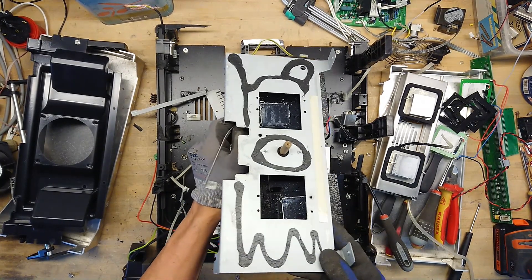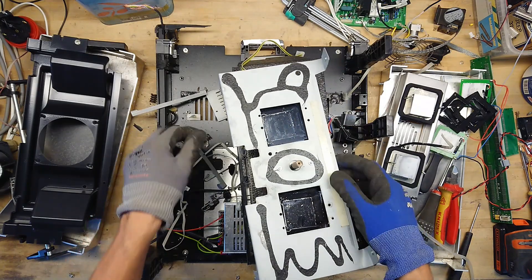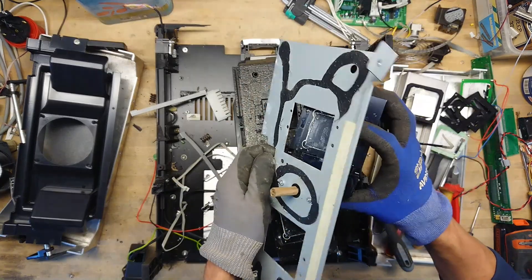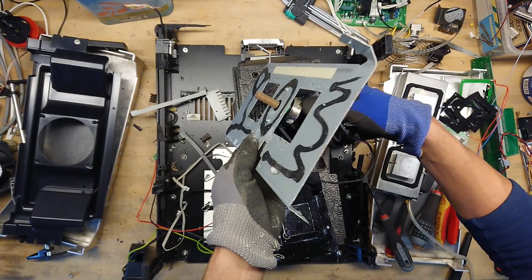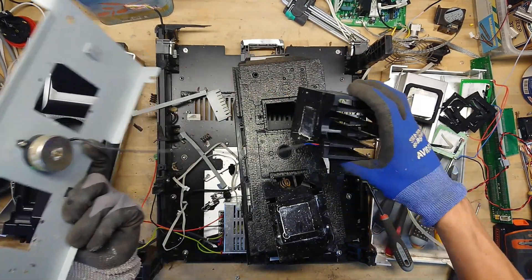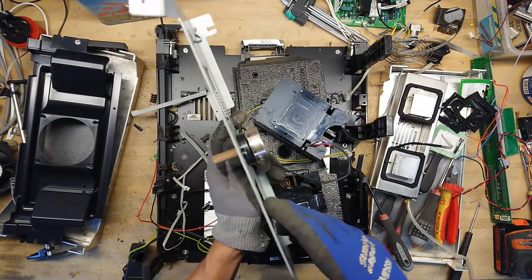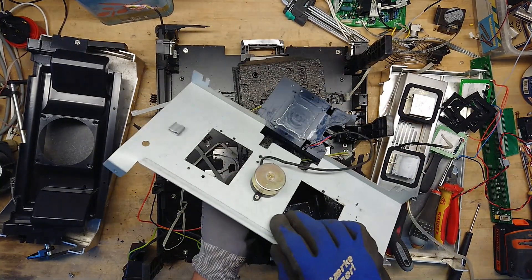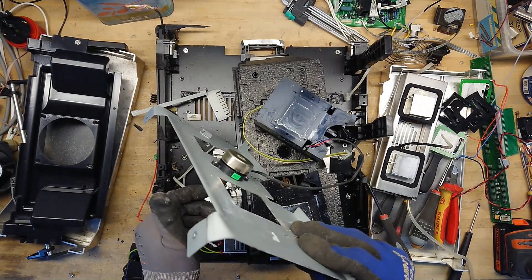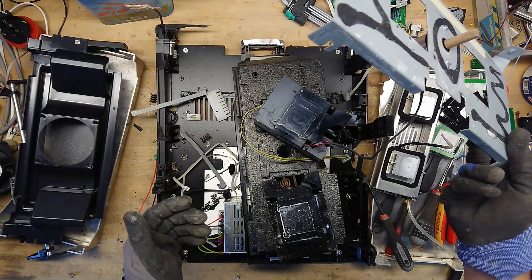Let's see if we can get a view of that little homemade fan. They even put the supply wire through the heat sink. That's also a dead-simple and cheap motor for that — no points there.